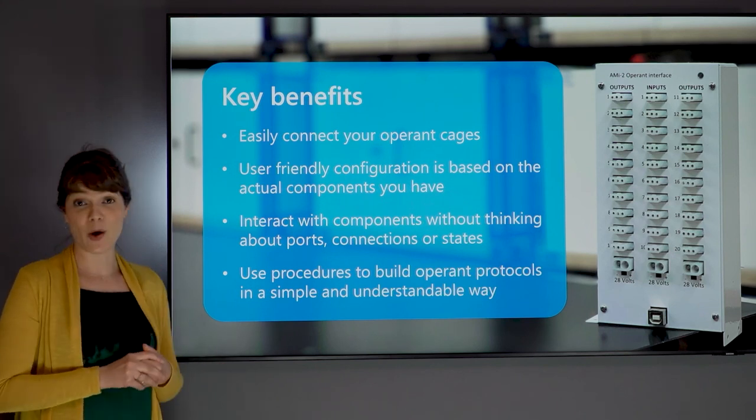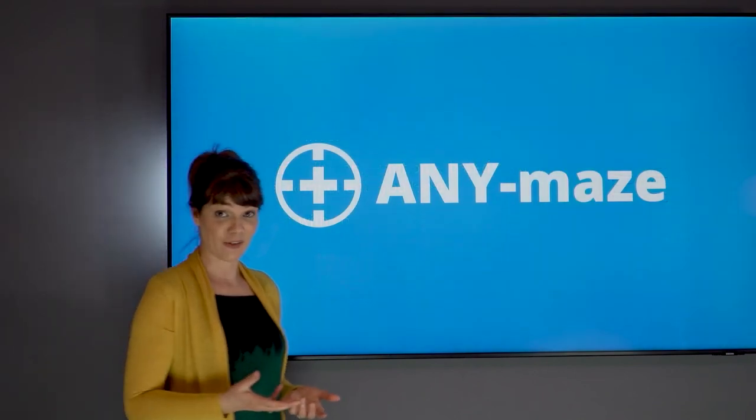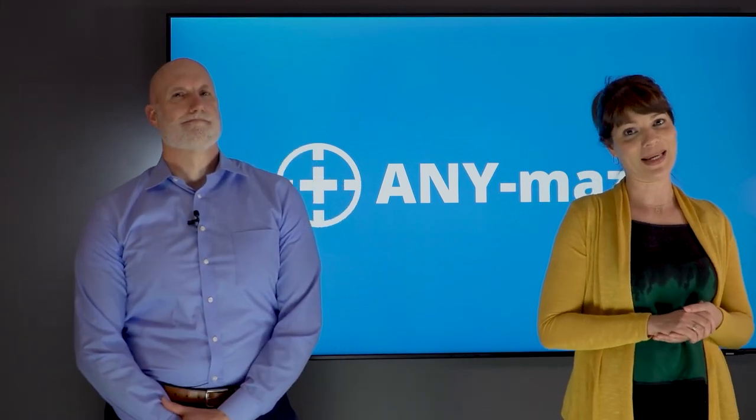So that's it. We hope now that you understand what the interface does and the benefits of using it to perform operant conditioning experiments using Anymaze.